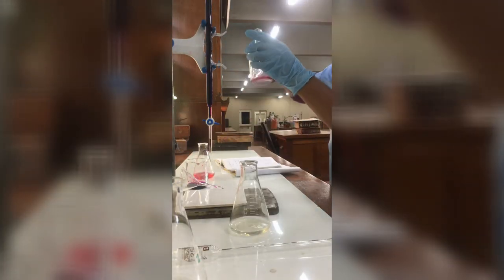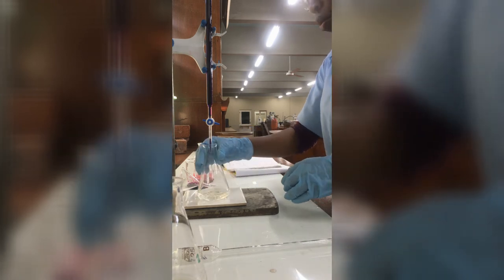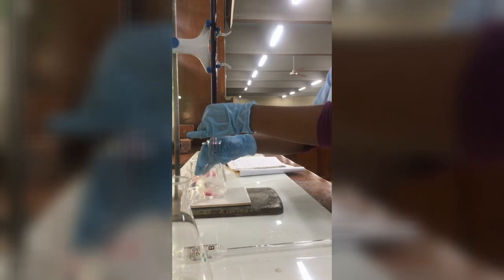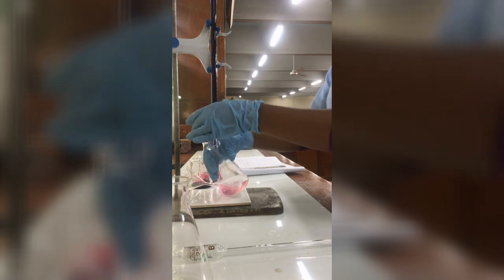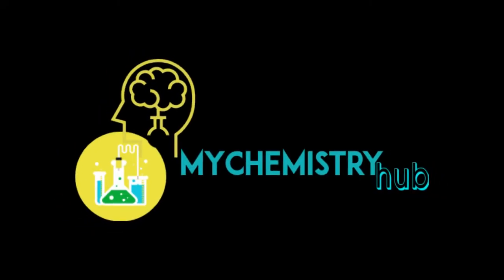Thank you. And there we have it — our faint pink color. And of course, we take our final reading. We will talk more in a post-lab discussion.